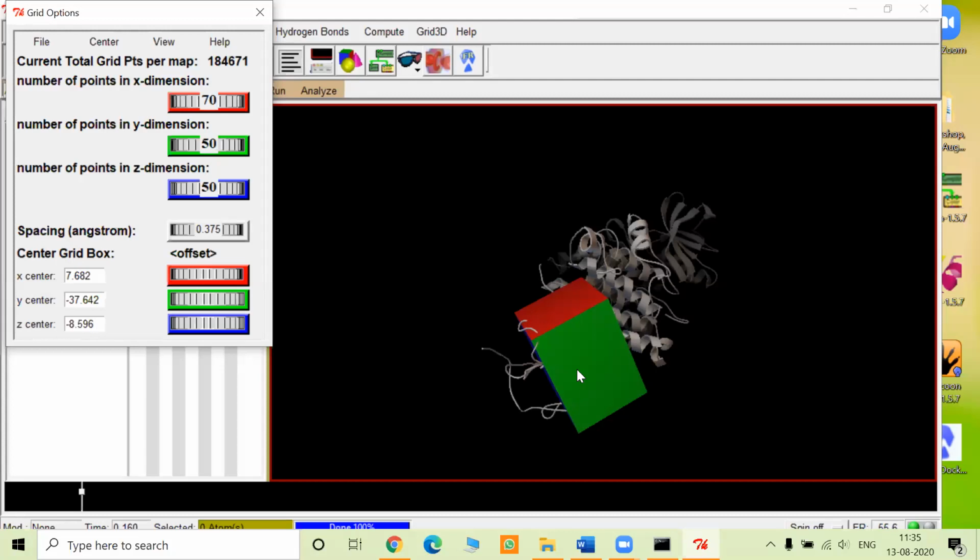Receptor flexibility. When you take two different ligands and compare them, you check for the minimum binding energy. Binding energy is what matters here, which will come at the last, so that you can finalize out of 2 or 3 or 4 drugs or ligands, whichever you're choosing, the ligand with a particular pose or conformation giving you the minimum binding energy. That will be your future target molecule, which you can use for the process.